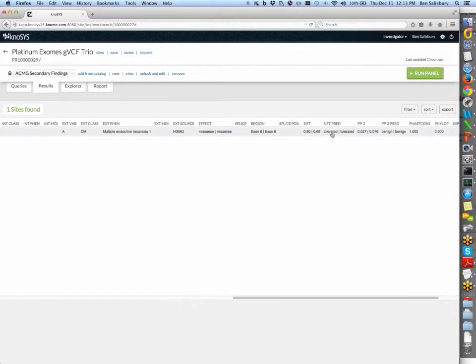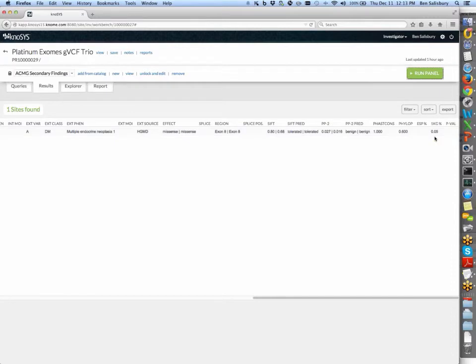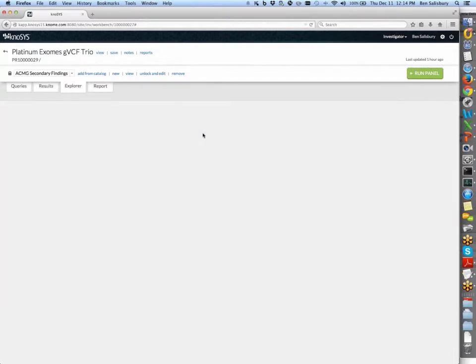But if we keep looking at this variant, we notice that in fact it has been observed in the background reference population, 1,000 genomes. That's still quite rare at 5/100%. But it's also marked by SIFT and PolyPhen as likely to be benign or tolerated. So we can take a look at this variant by clicking on the row.